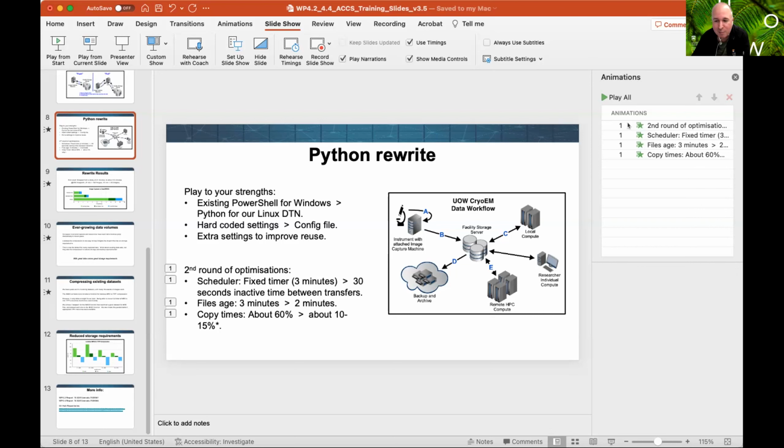The DTN that we were using in the middle, we had done a lot of work with at this end with Monash, with RNet, to optimize the transfers, sending data down, and tweaking some of the network stack settings and all that sort of stuff. So potentially that machine was better at transferring data than the capture PC. So I can't really point you at any one thing that say, hey, do this, and the transfer speeds are going to go through the roof.